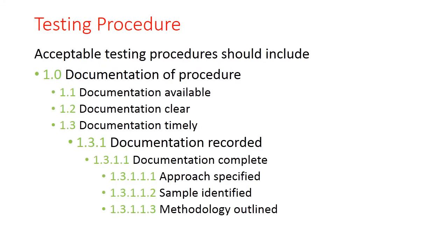Then once we have the prototype or the final software, we have to carry out our own testing. For that we have to prepare documents which mention the approach specified. We have to develop our own testing strategy. We have to mention what approach we are going to adopt for testing the newly coded or newly prepared laboratory information management system software.